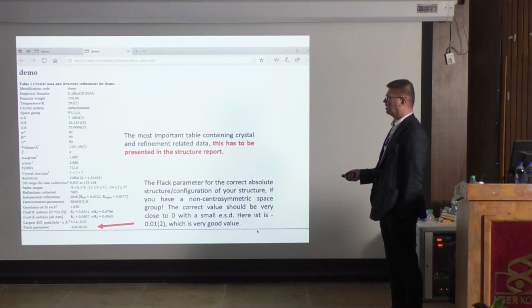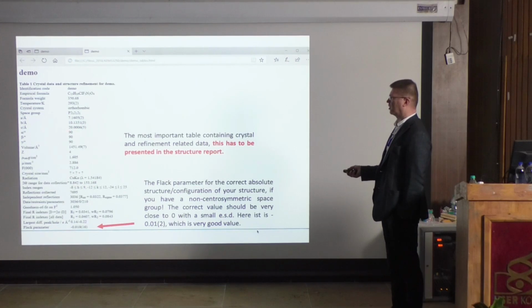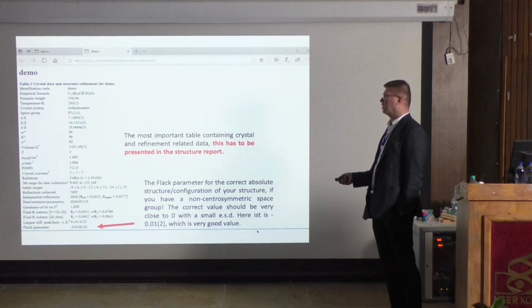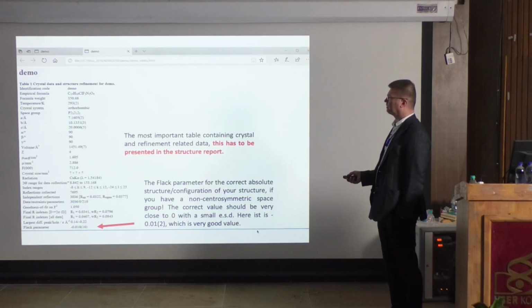And then this F000 is actually the number of electrons in the unit cell. And that number, of course, indicates how many electrons, and it is an indication about also diffraction power, but also about the contents, what we have. So this number is actually 4 times the electrons of this, because we have 4 molecules in there. But it prints it out. This was, again, an important number, which is indicated 20 years ago. It has lost now its importance.